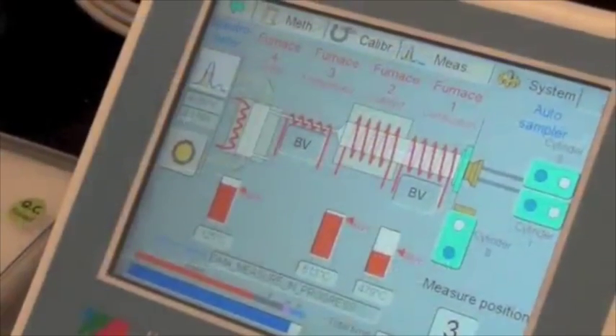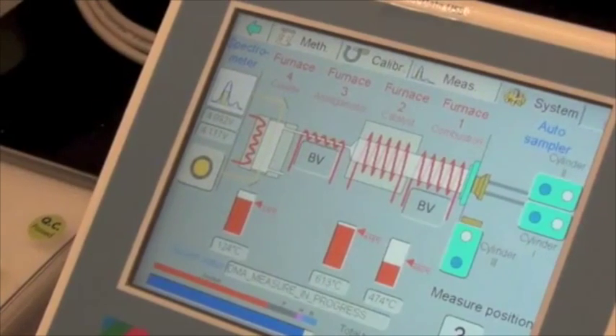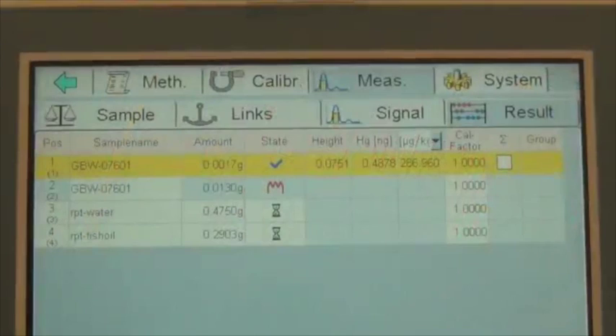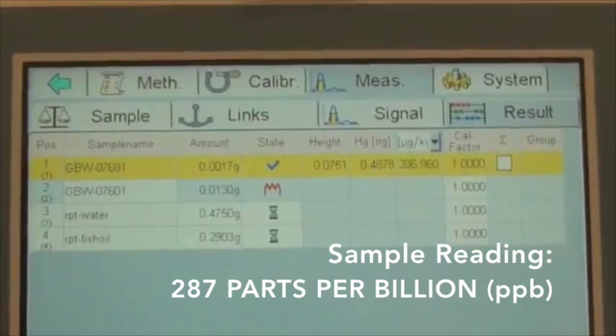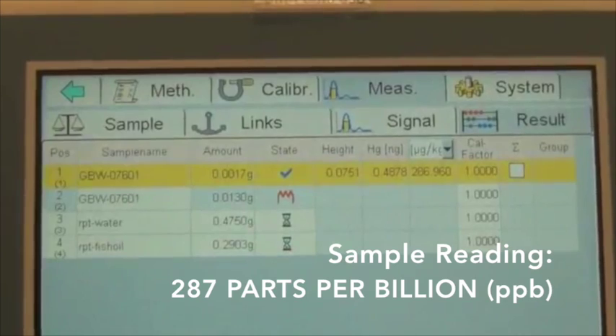We can monitor the process of the analysis by checking the status of different compartments of the DMA, and how much time remains for each sample. After each run, the output of the analysis is presented and saved on the screen. The concentration of mercury in this sample, for example, is 287 micrograms per kilogram, or parts per billion.